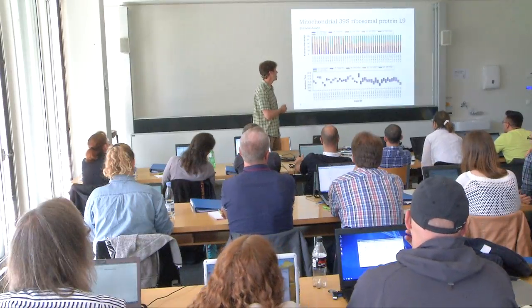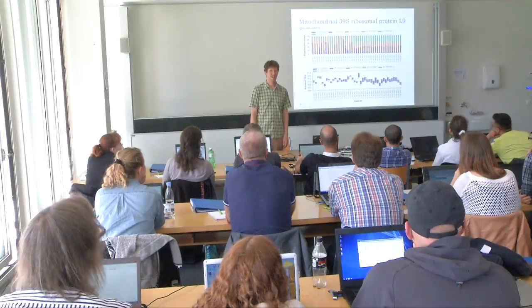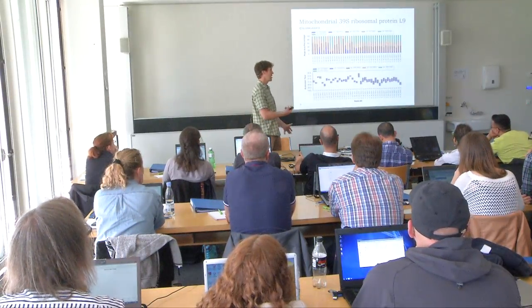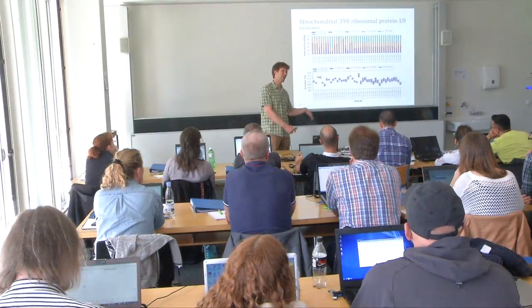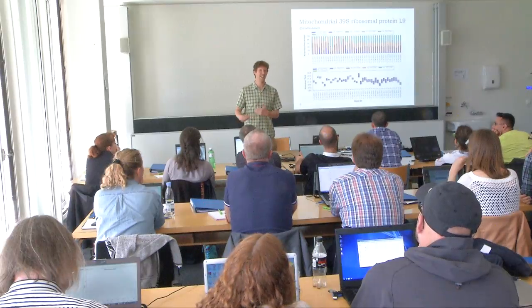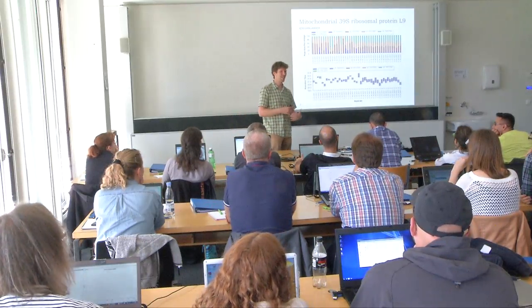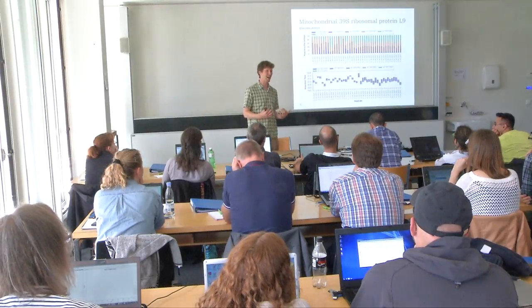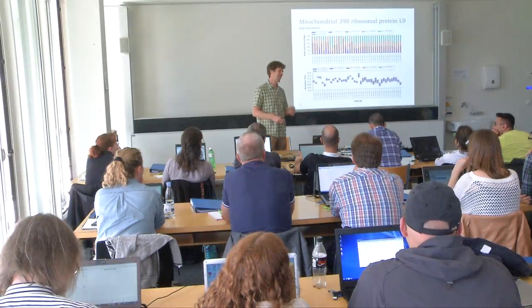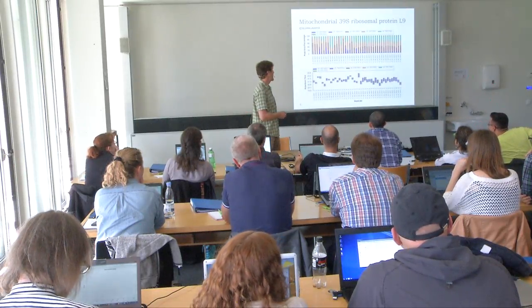Okay, so onto this one. So what do you see in this one? Pretty messy, right? The first course I taught, we decided to use this data set. And this data set didn't actually end up getting published, which maybe tells you a little bit about the data set. But I think it's great to actually have a data set with some problems, because perfect data sets are often really easy to look at, and you can learn a lot from data sets that have problems.